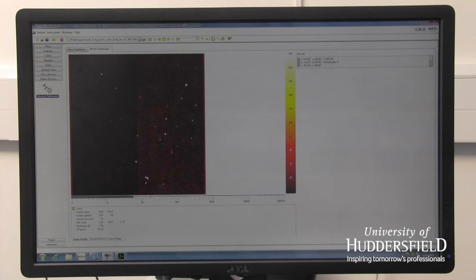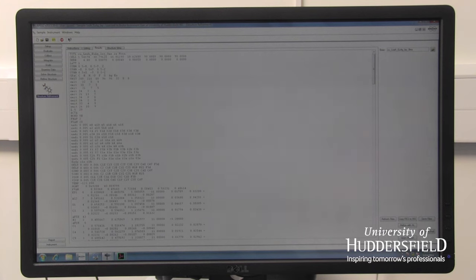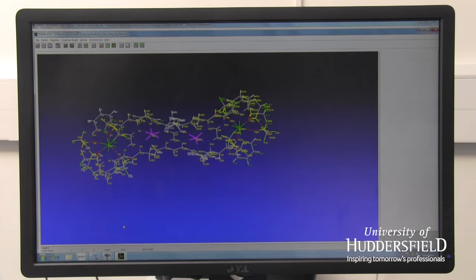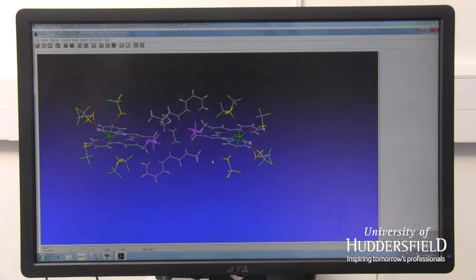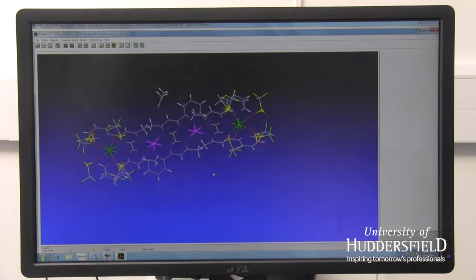Once you've got the data, you can use that to find out what molecule you've got. Going to this screen, we come up with this picture here. And this picture is what we've formed in our crystal, what molecule we've got.